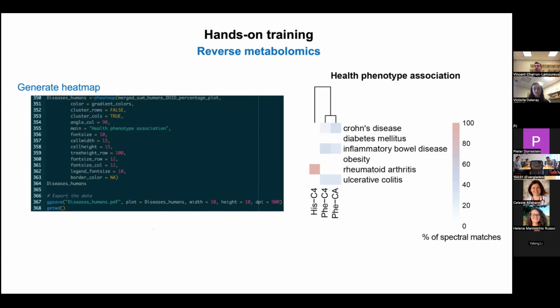So here we're just trying to attach the information that we have: the body part distribution, organ distribution, biofluid distribution, and whether it seems prevalent. Now the validation step will depend on your questions and how you're going to validate these results, or if you want to do the statistical analysis. So what we suggest after you get these heat maps is to go back to the actual data set that these molecules are found in, proceed with the data processing, and then do your statistical analysis afterwards. But at least it will guide you to generate your hypothesis, or formulate your question that you can address. Yeah, thanks. It makes sense.